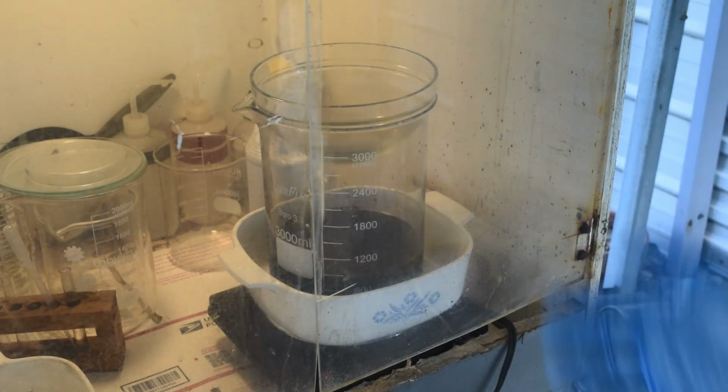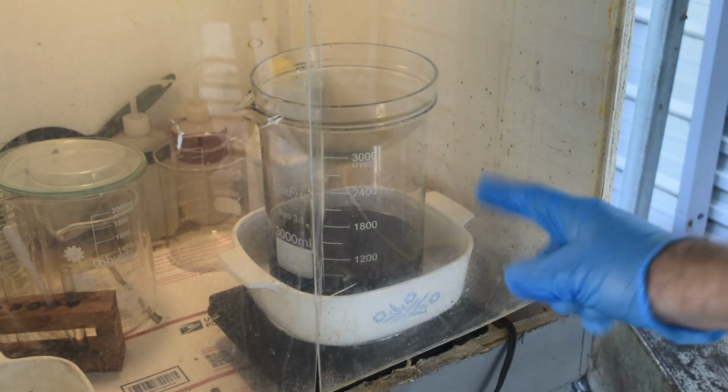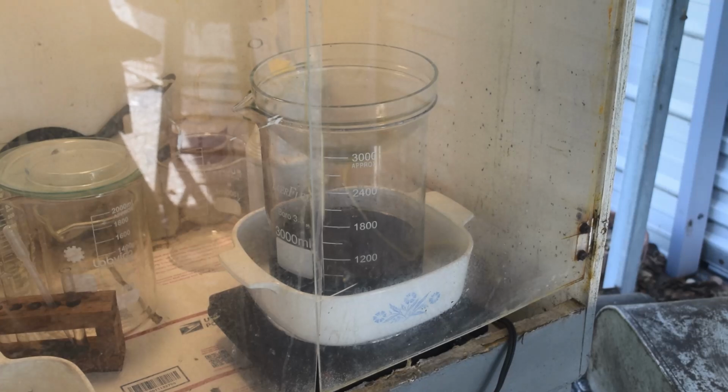I'm not seeing a lot now as it's cold, so that leads me to believe that we may have already got the bulk of the iron in solution, although we'll see what it looks like when it warms up a bit. It may just be playing possum and fooling me in there. I'll give you a look at it once it warms up, and we'll see if I'm right or wrong.